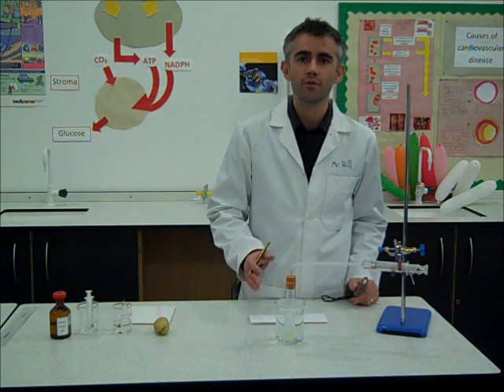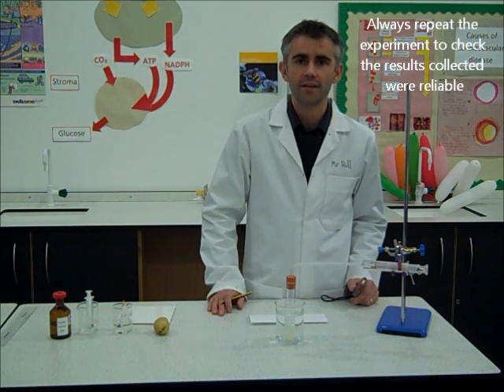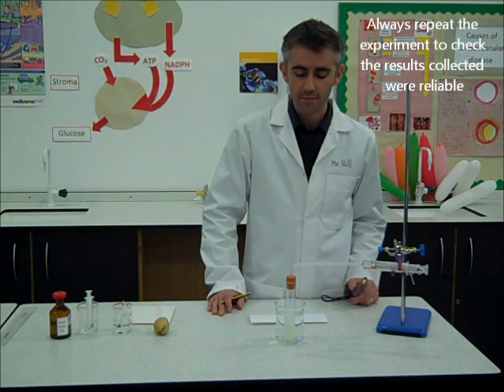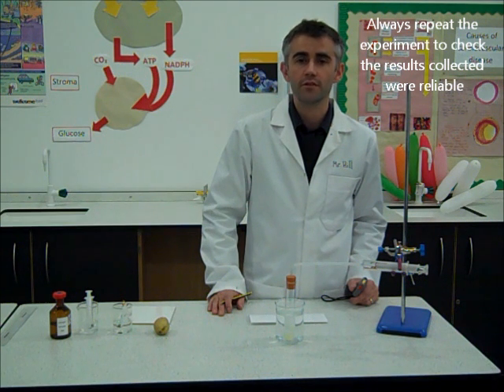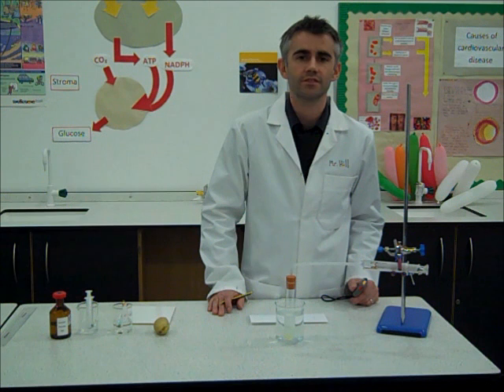I'll now have to repeat that 2 more times for the same concentration using the same number of discs. I will then take an average to improve reliability and then I will also use 4 more concentrations of catalase by lowering the number of discs used each time.